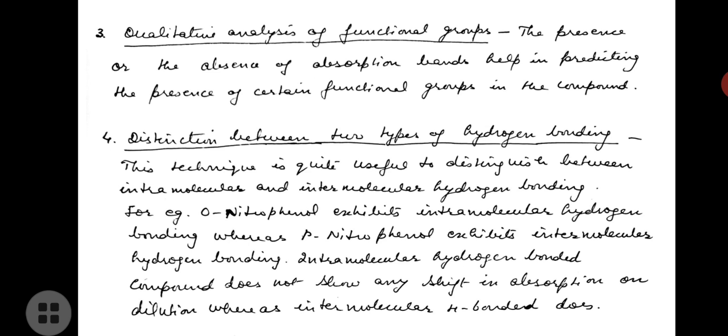In case of NH2, two absorption bands appear in the above region, while an NH group gives only one band. Its distinction from OH can be made from the extent of hydrogen bonding, which is stronger in OH compounds and causes more lowering in wave number.